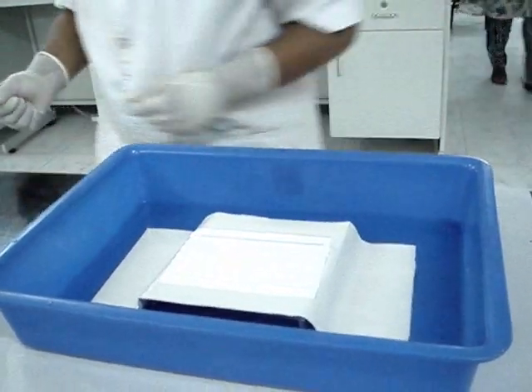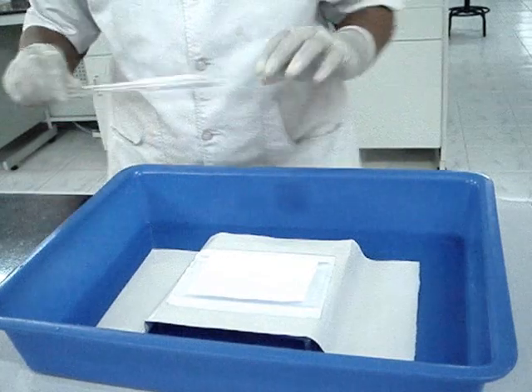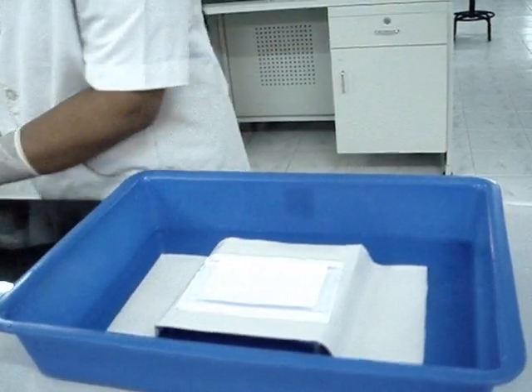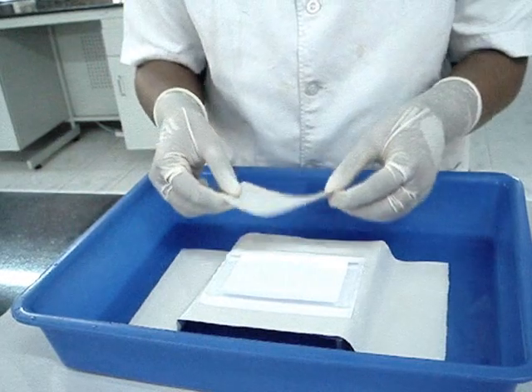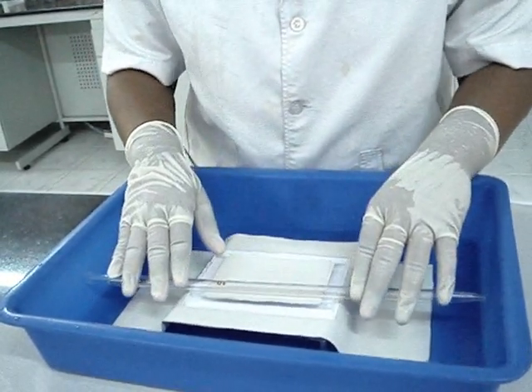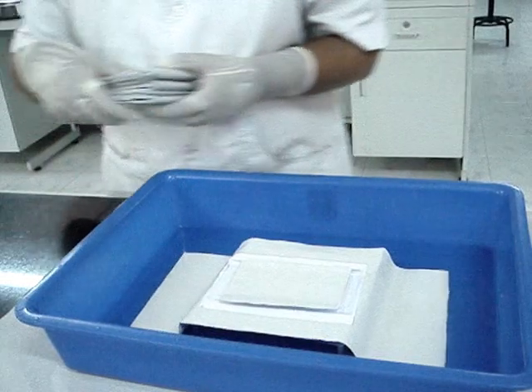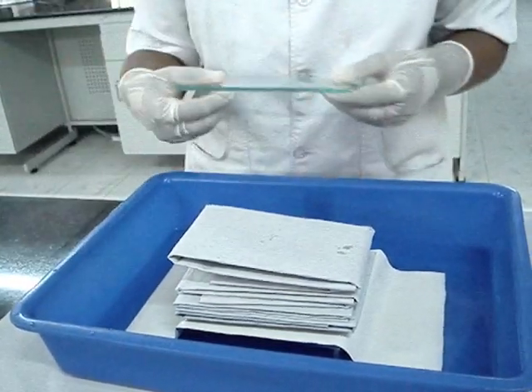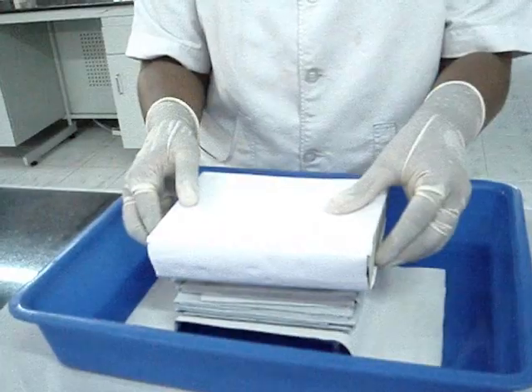Carefully place the gel containing the RNA sample followed by the nitrocellulose membrane. Take two Whatman filter papers, cut to the needed size, wet them with the transfer buffer and place them over the nitrocellulose membrane. Place a stack of filter papers, then place a glass plate. Keep a weight over it so that the RNA from the gel will start binding to the nitrocellulose membrane.